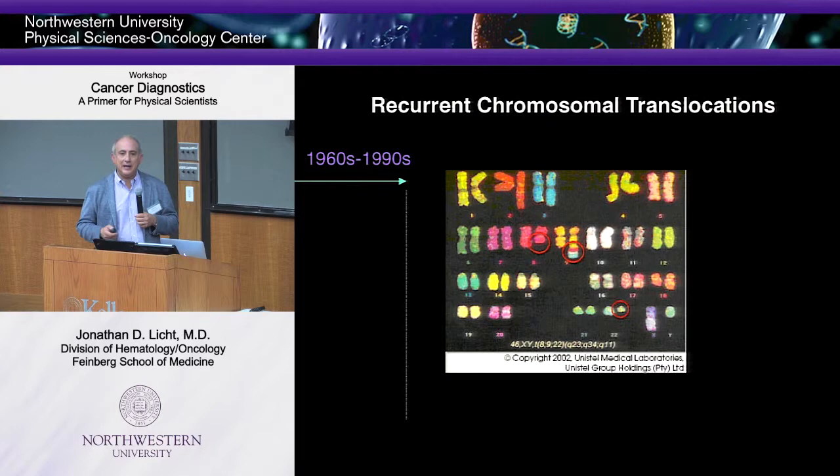But generally what's done by cytogeneticists is they look at these metaphase spreads, they virtually cut them out using Photoshop, and they look at it and they know what each chromosome should look like. It's got a stereotypical pattern. And they see a little bit of this chromosome missing and a little bit of this chromosome gained, and they can see with their eyes that's the 9;22. The spectral karyotyping shows that these blue sequences here have moved over to the orange over there. That just confirms it. This is necessary for a research tool, but it's not generally done too often as a diagnostic tool.